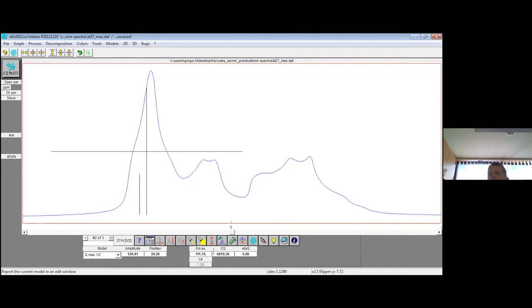This is quantum mechanical DFT-based calculation, but there are many free packages. The one used a lot for prediction of chemical shifts of solids is CASTEP, which is nowadays free. It wasn't for a long time. And Quantum Espresso, this is also free and a very rich package, which offers a lot of types of first principles calculations of other sorts of DFT, of course. So calculation of NMR parameters is also one small part of these packages.